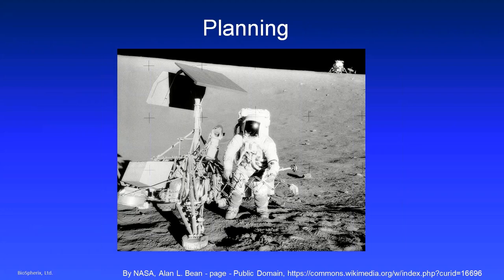So planning. Now, those of you coming to the Xvivo system training from a GMP environment will understand what I mean when I say planning is your superpower. For those of you that are coming from a more academic environment that are working toward GMP, this is something you're going to need to learn and to integrate into your daily work life.